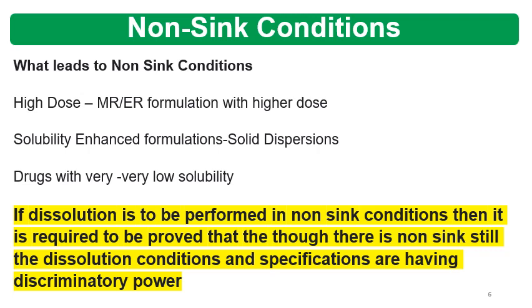Then solubility enhanced formulations like solid dispersions. Then drugs with very low solubility. Some molecules show zero solubility in all the pH media. Also, if you use surfactants, it is still difficult to achieve sink condition. So at that time, the dissolution test is done in non-sink conditions.